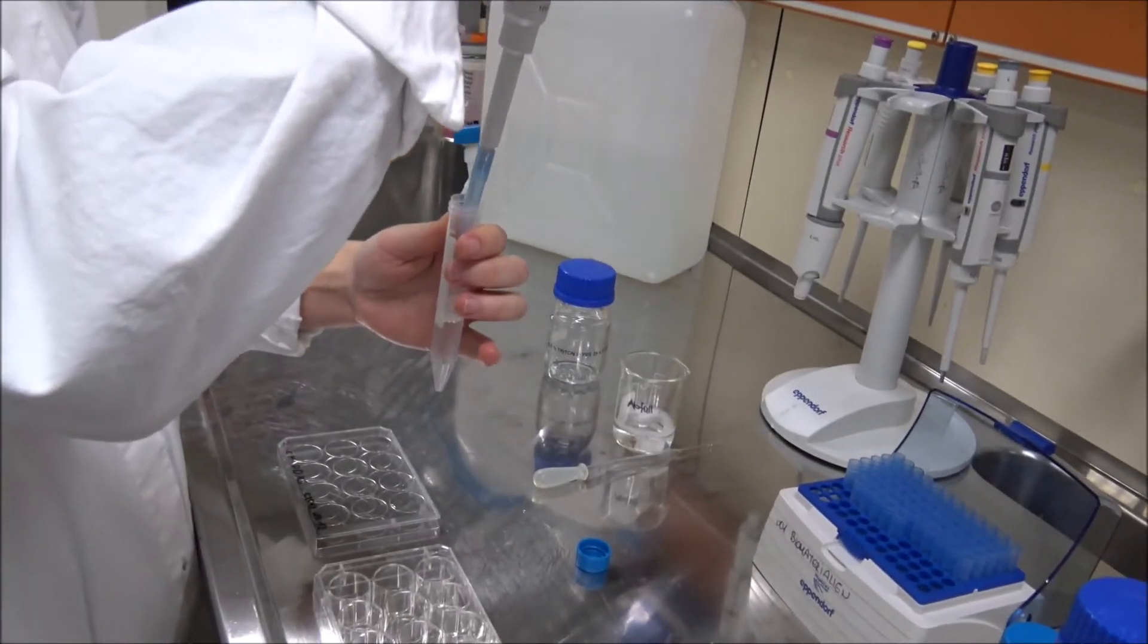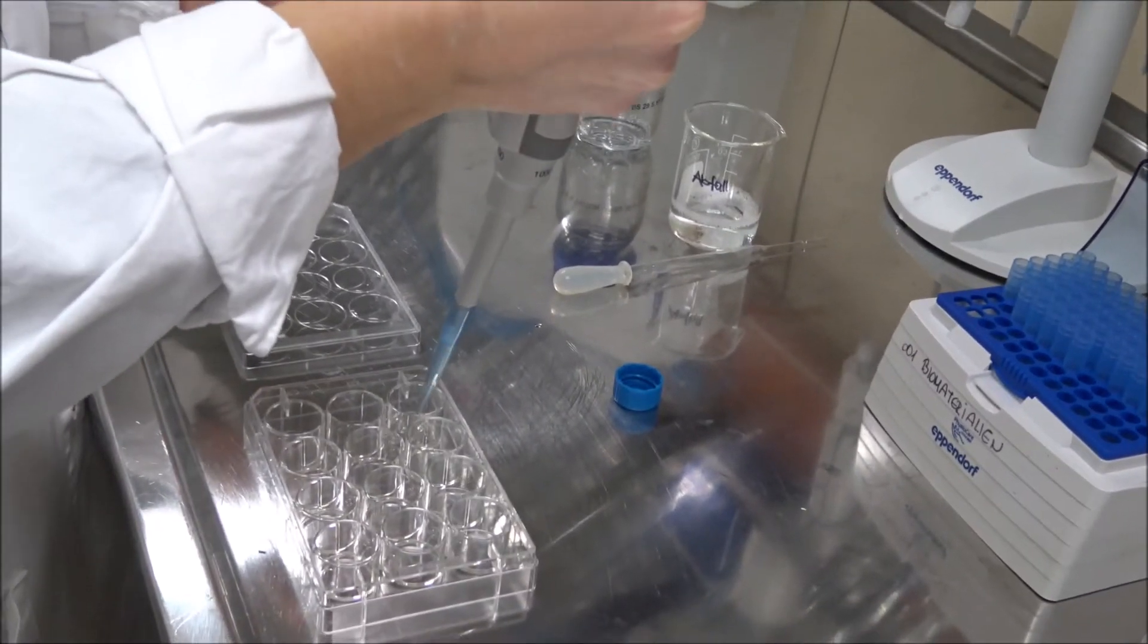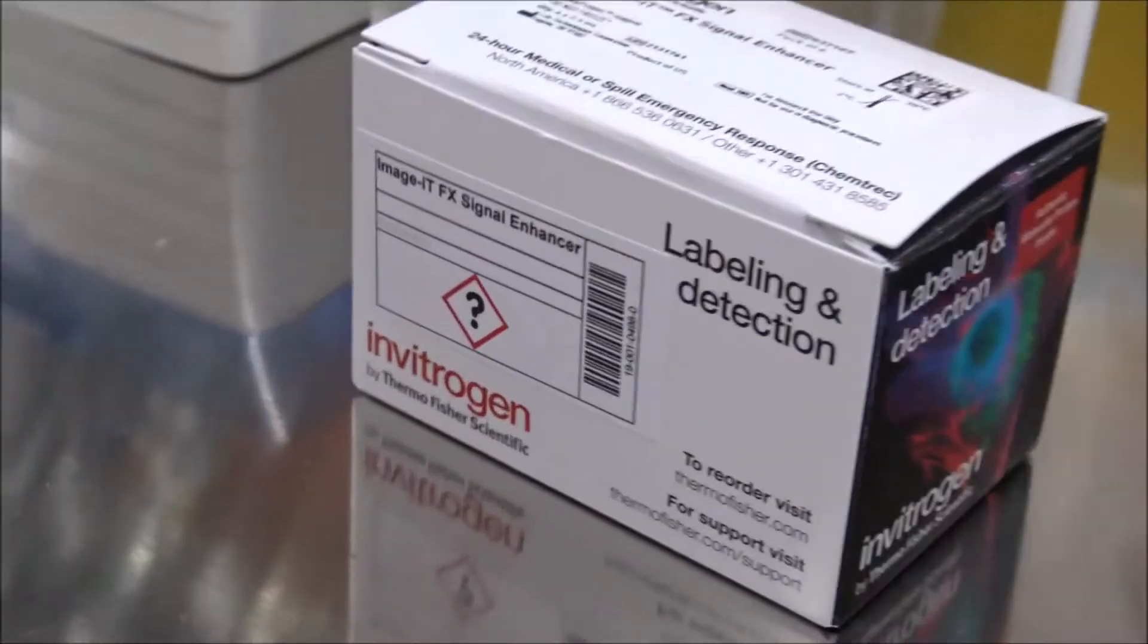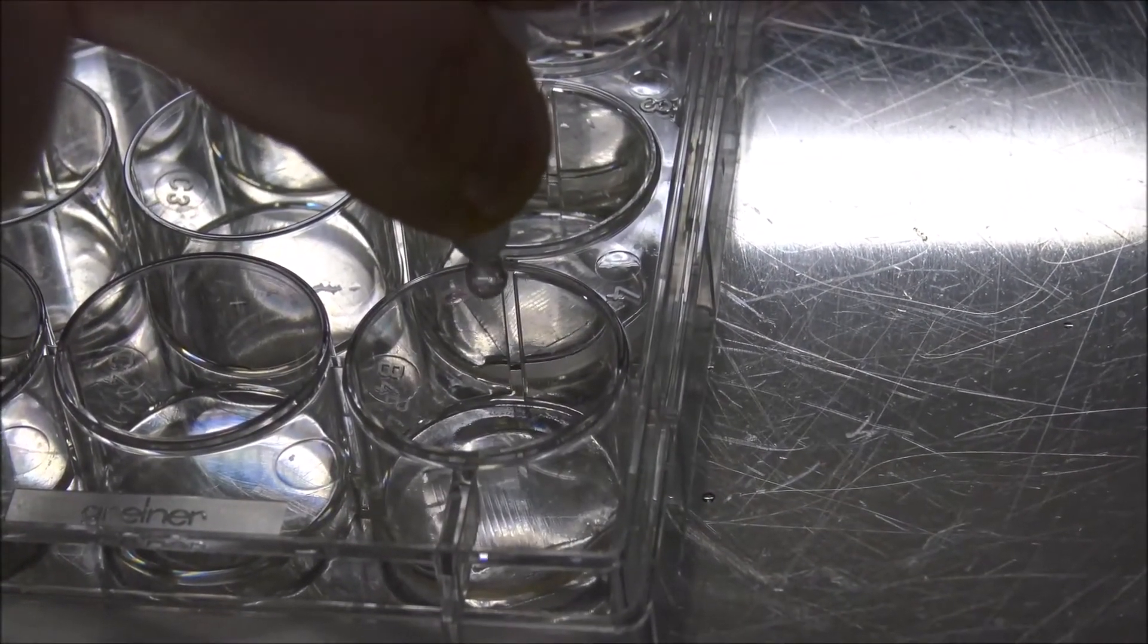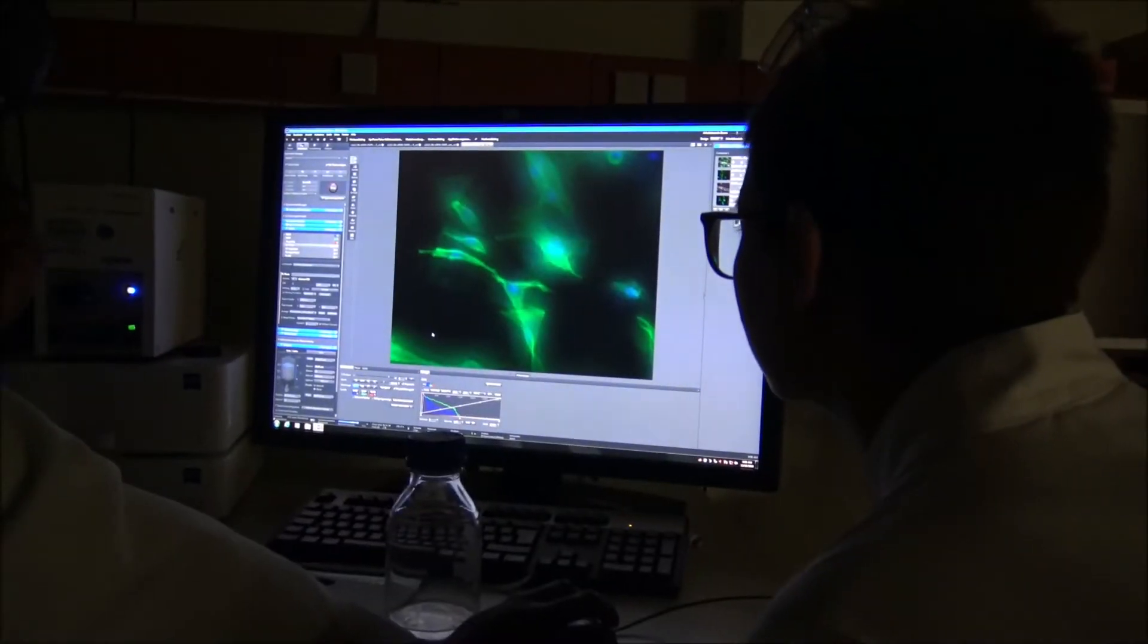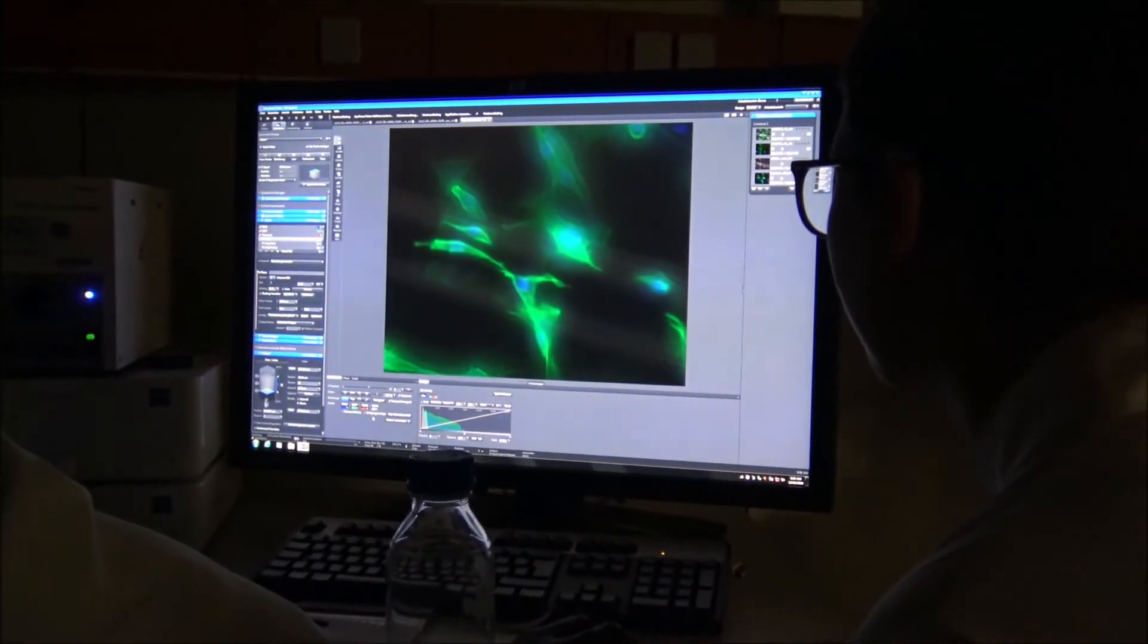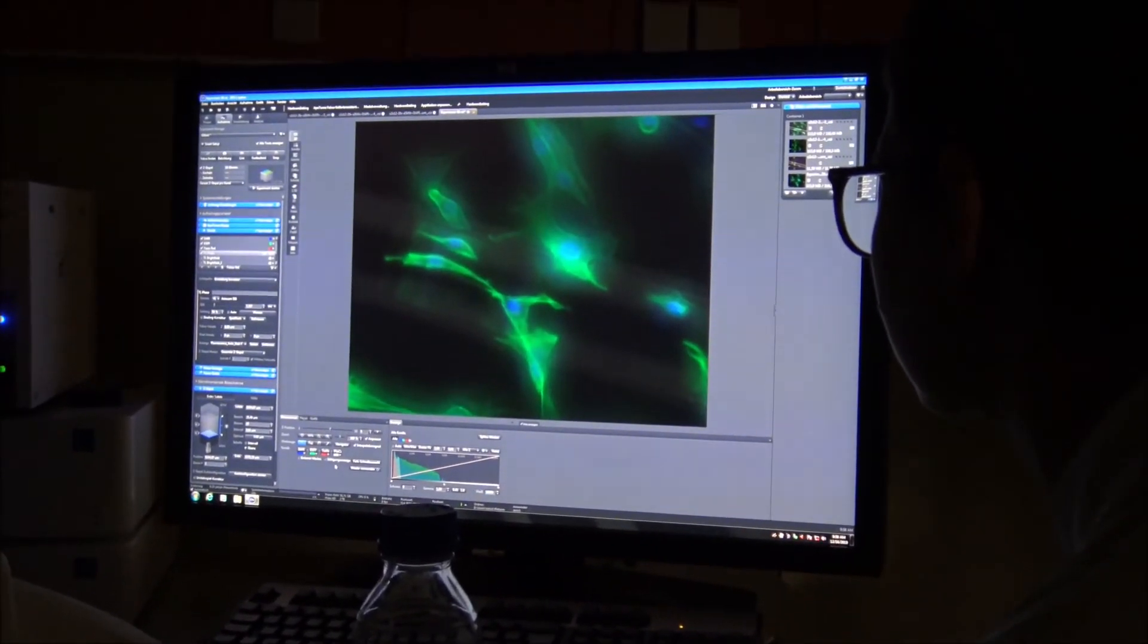To get an idea of the morphologic changes due to differentiation, we stained the nucleus with Hoechst, the actin skeleton with phalloidin, and a specific actin fiber called alpha smooth muscle actin with antibodies. The staining showed if the myoblasts differentiated into myotubes as they are elongated fibers and contain multiple nuclei. Alpha smooth muscle actin indicates the contractility of the cells.